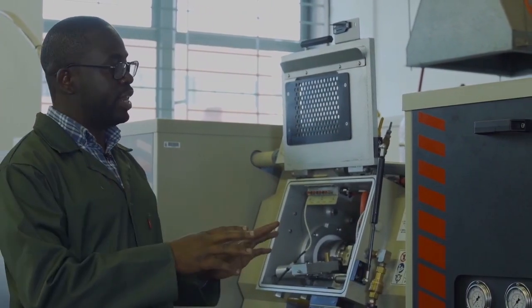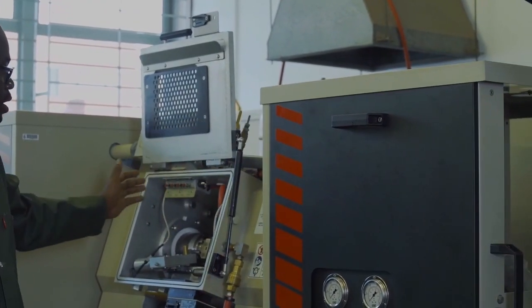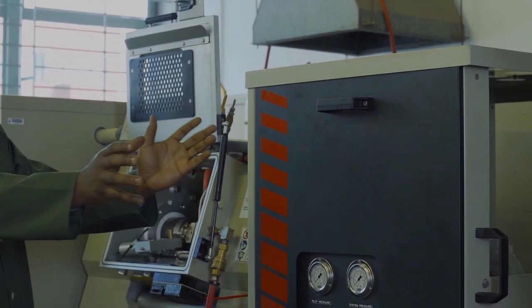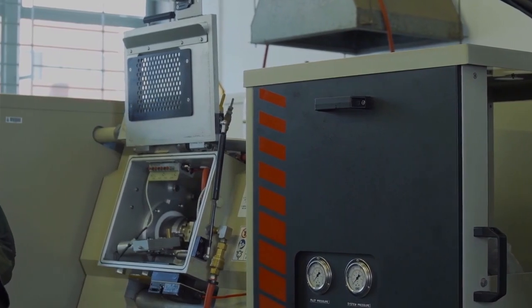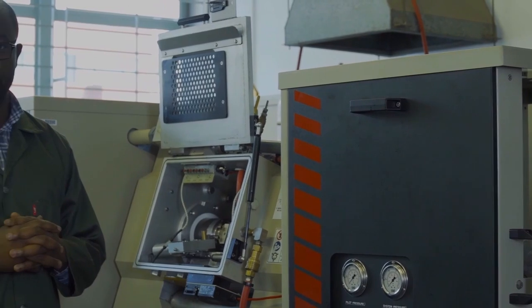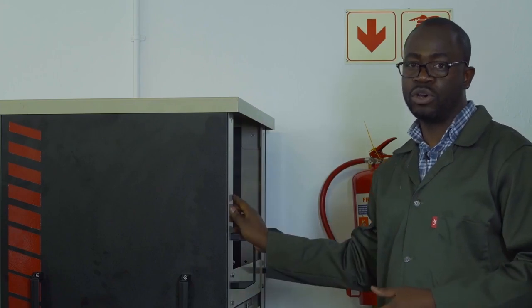We have the mobile conversion units that can be divided into two. On installation now is the hydro wedge, which I am touching here. We can actually remove this part and bring in the second mobile conversion unit that is called the pocket jaw — I will show you that in just one second. So, I would like to show you the second mobile conversion unit, which is the pocket jaw. I showed you the hydro wedge earlier.